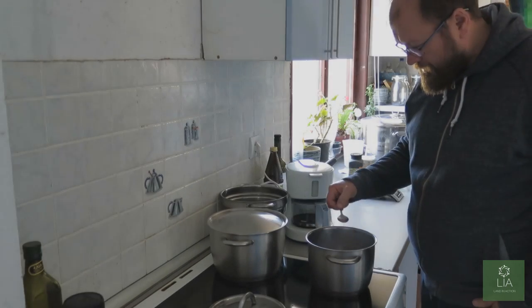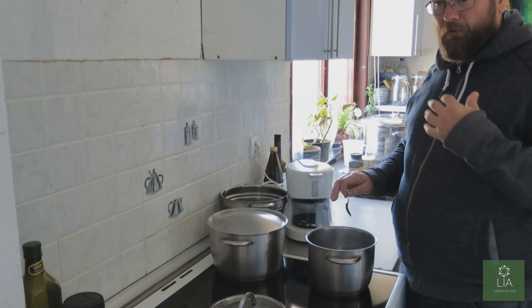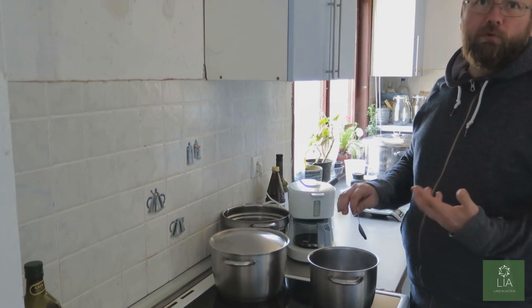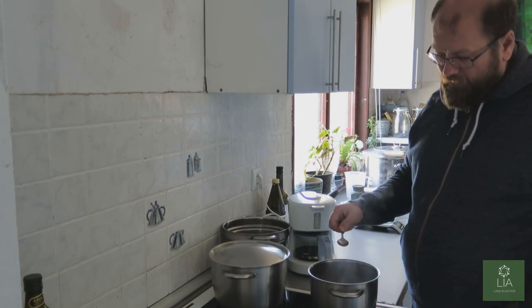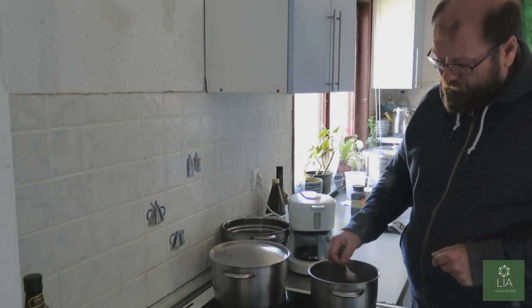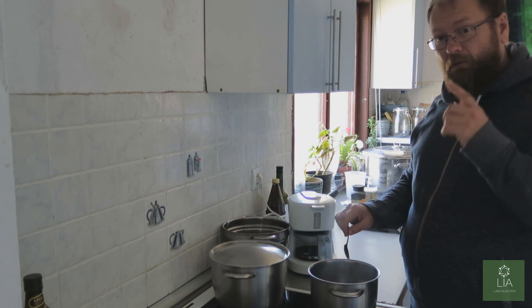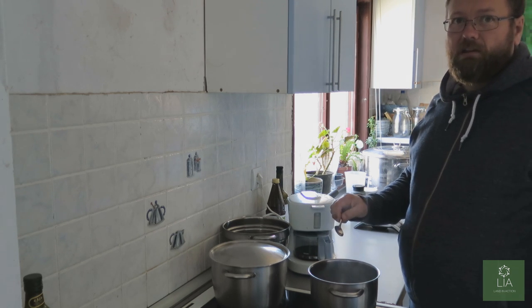Okay, so we're not going to bring this to the boil because when we put this into the pressure cooker for sterilization, it will come to a boil inside. So all we're wanting to do is basically dissolve any of the particulates, the agar and the yeast that we've added. So that's now done, it's almost hot enough for coming up to the boil. So we're going to switch this off and transfer it into a nice warm jar. And then we're going to put it outside into the pressure cooker.